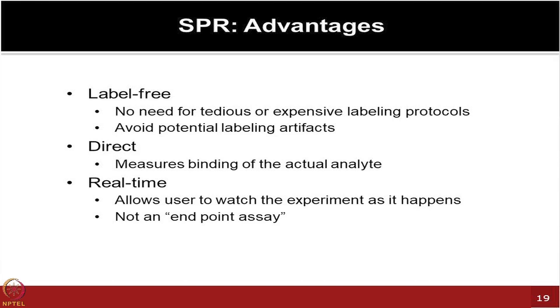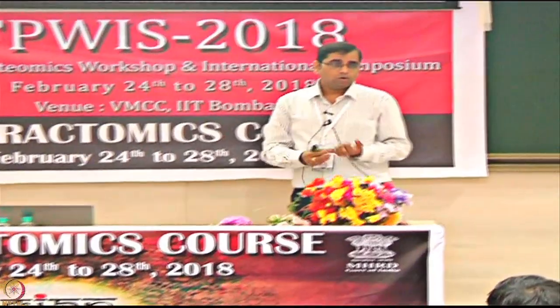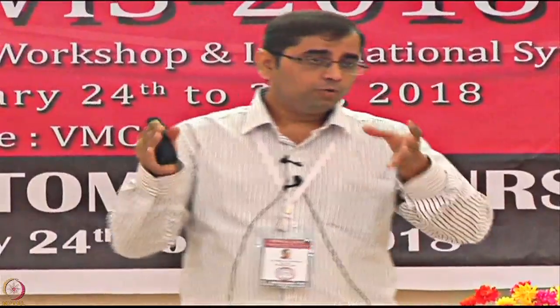Many times we try out different concentrations of different antibodies in the initial screening, or you can try different flow rates. So many things you can play with in the initial round of experiments to find out the best condition for your binding to be observed. Once you finalize those conditions, you can apply the same to your full experiment with many of the molecules of interest.